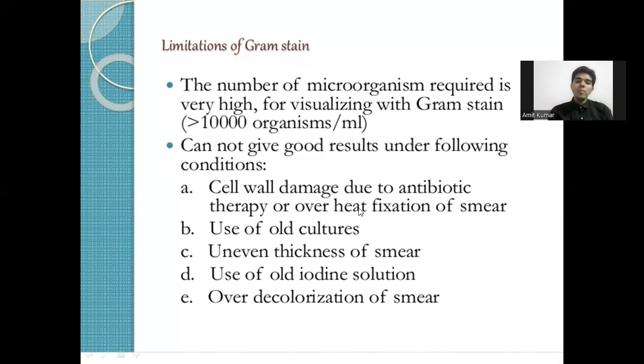And if you overheat the smear, that also damages the cell wall and makes it very difficult to observe the organism under the microscope. Then the use of old culture: if the bacterial culture is too old, that also leads to loss of the cell wall, and in that case it is very difficult to observe under the microscope.